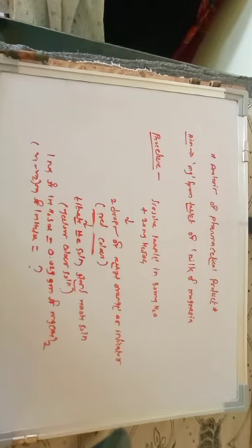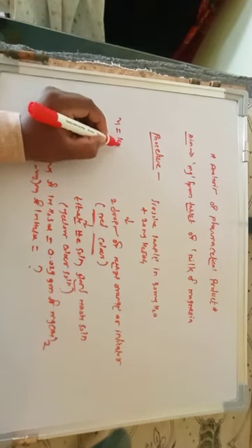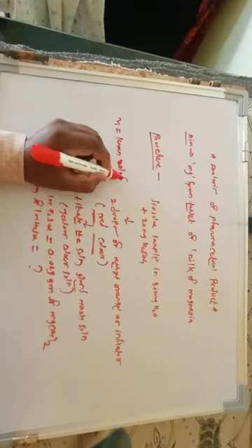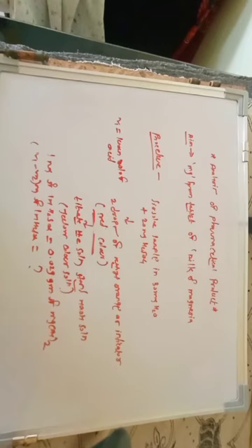It is the known volume of acid, meaning how much acid is added.